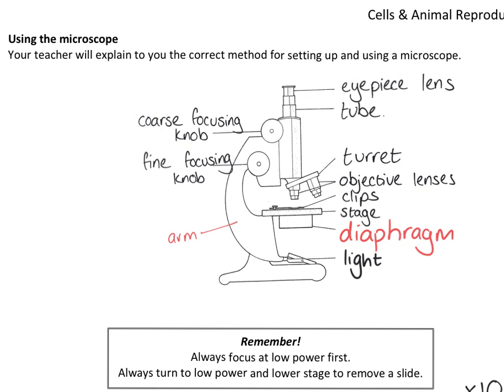Hello First Form. In this little short teaching video, we're just going to do a quick recap on our work on microscopes that we did before Christmas. I'm going to recap the different parts of the microscope, which you can find on page 2 of your notes, and it's really, really important that you learn the different parts of the microscope and what they are used for.